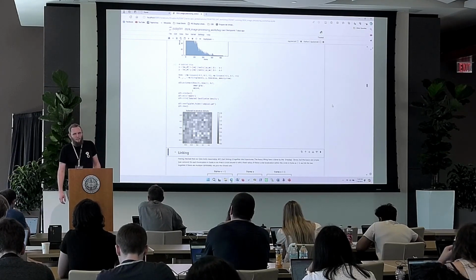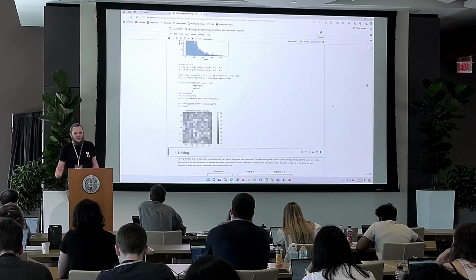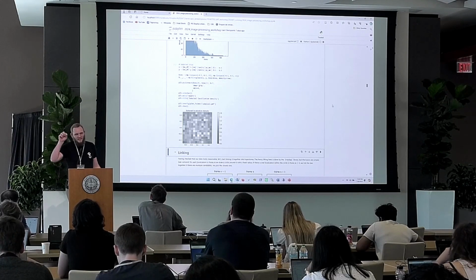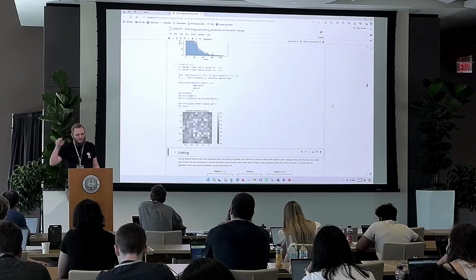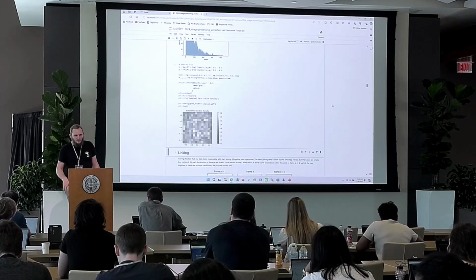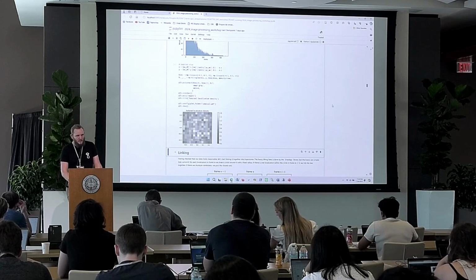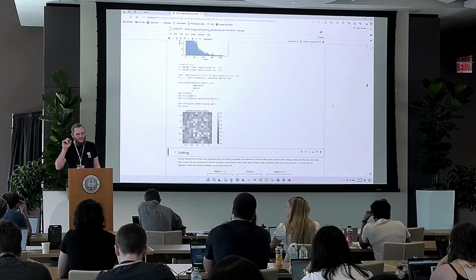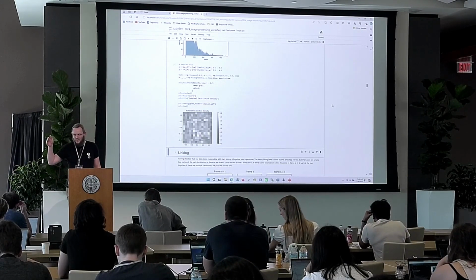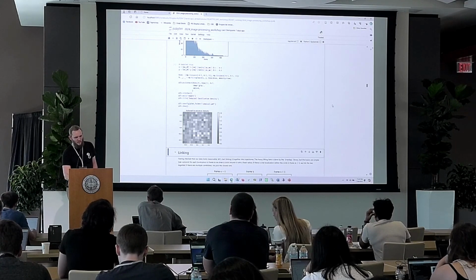One issue that could happen is if this subpixel localization screws up for some reason, it might put all the localizations, say, in the center of a pixel, or on the edge, or something like that. So one quick check we can run to see that there's at least nothing obviously going wrong is to take the part after the decimal point of the localizations in pixels and plot a histogram. And that's exactly what this code does here.